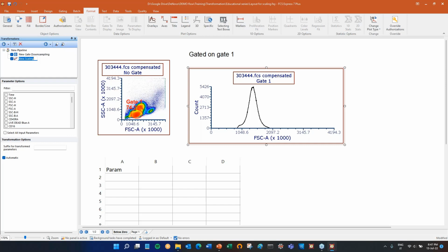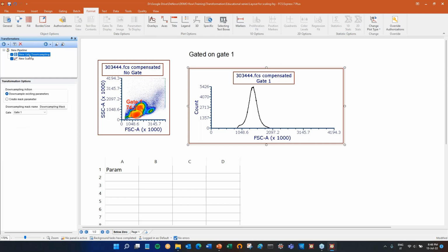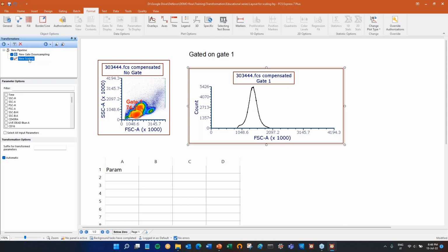Think about scaling with log scale, which is the simplest one. In one sample, your positive is 10 to the 4, log base 10 will be 4. In another sample, you have 10 to the 5th, log base 10 will be 5. So still you will have a discrepancy. This is something that, if you want, you can do with normalization to the minimum and maximum, for example, maybe normalization to the mean. It's something that we will see tomorrow. Thanks for asking.